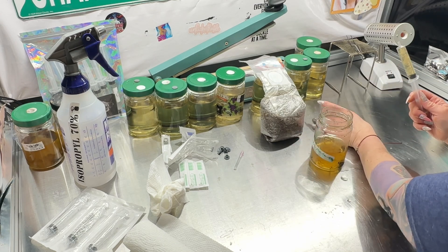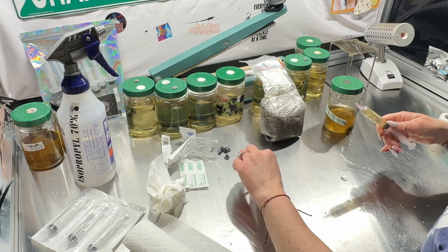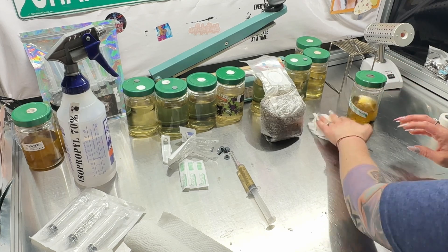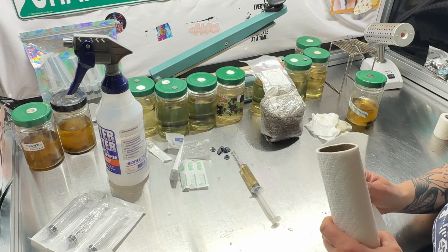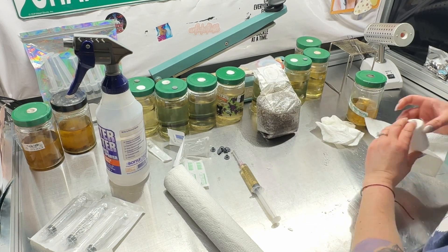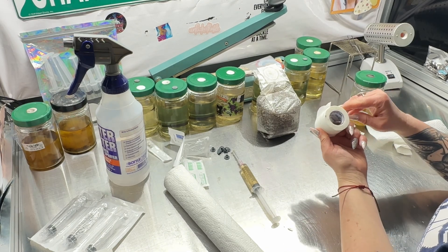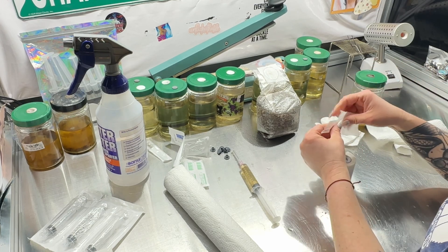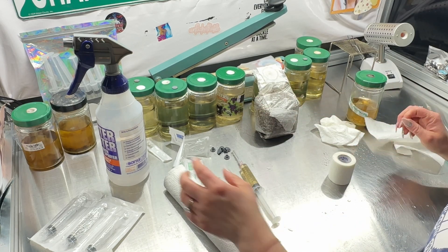We have some culture. The first thing you want to do when you don't have an injection port on your bag — and I know this from experience because way back when I was doing this before I had a flow hood, I was injecting bags without injection ports — you want to spray down the bag with alcohol and wipe it. Put a piece of micropore tape on it, and this is so you don't lose where you put your injection. When you poke the hole in it, you're not searching all over the bag for the hole. I've lost the hole many times.